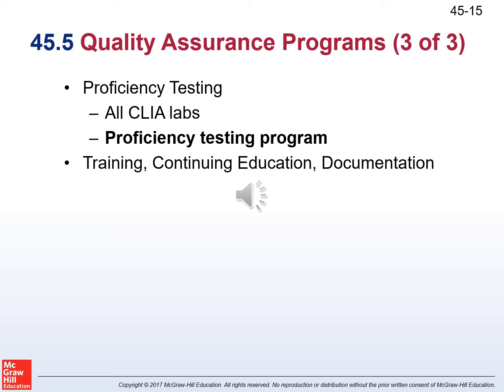Employee training and continuing education, along with written reference materials and documentation for all procedures conducted in the POL, must be provided to the medical assistant. Reference material could include safety data sheets, standard operating procedures, safety manuals, equipment manufacturers' user or reference guides, clinical laboratory technical procedure manuals, regulatory documentation from OSHA and CLIA, and maintenance and housekeeping schedules.